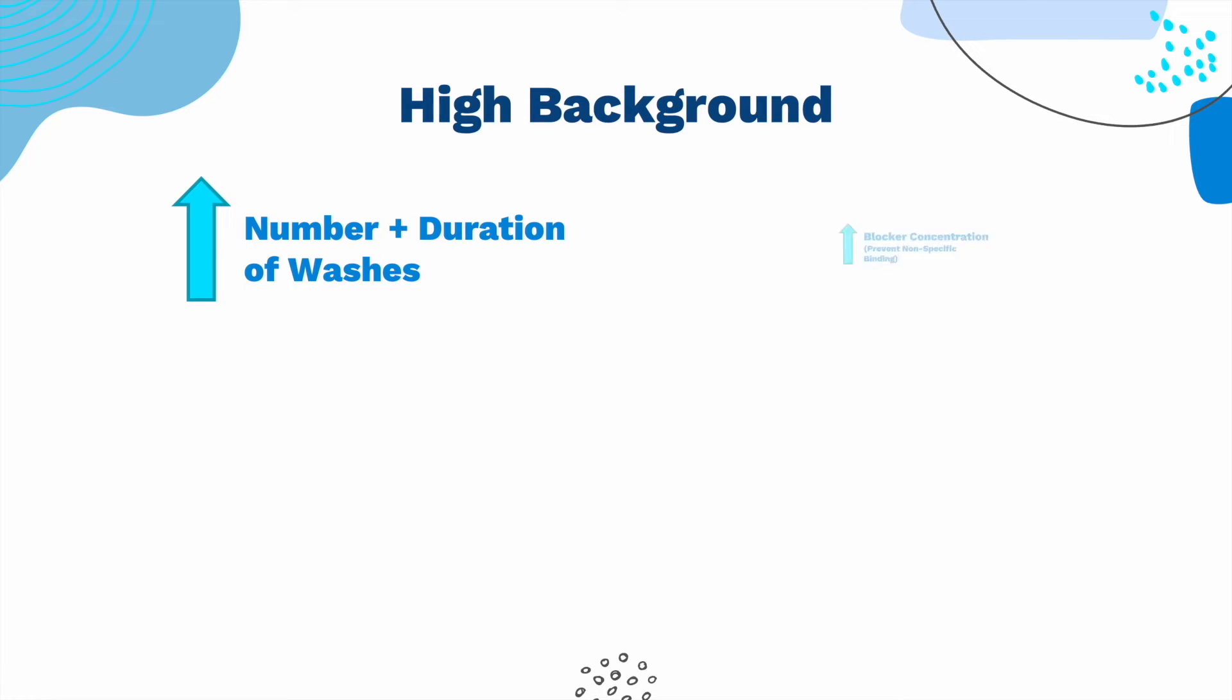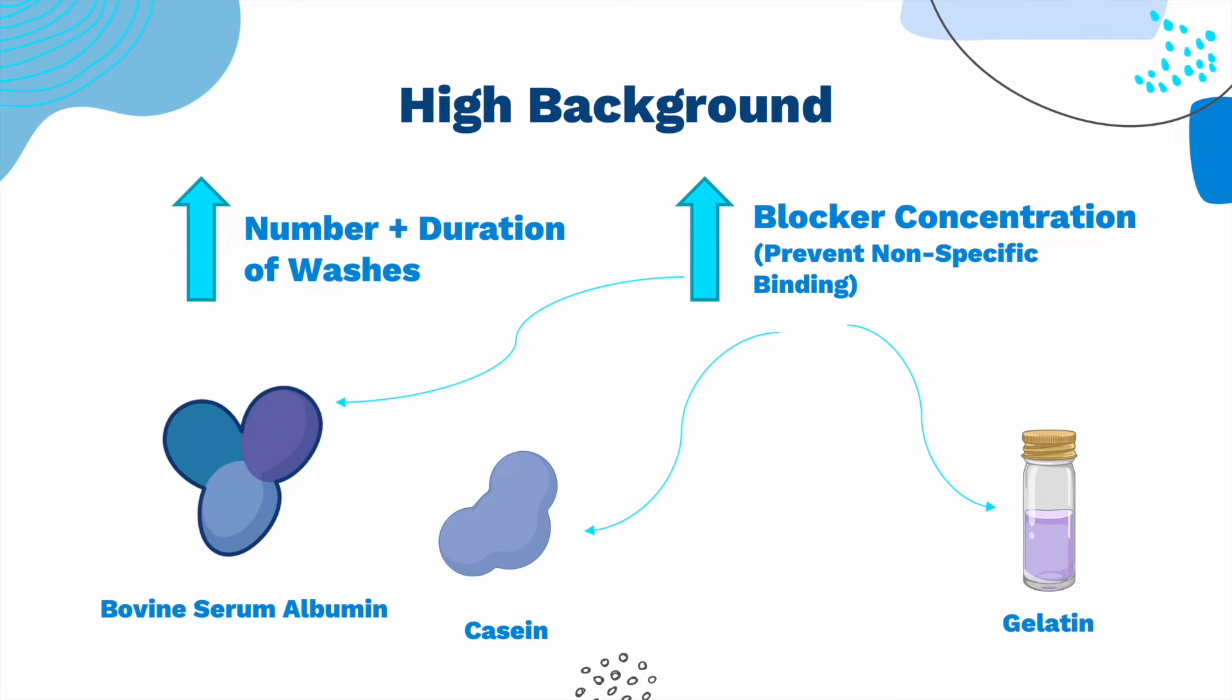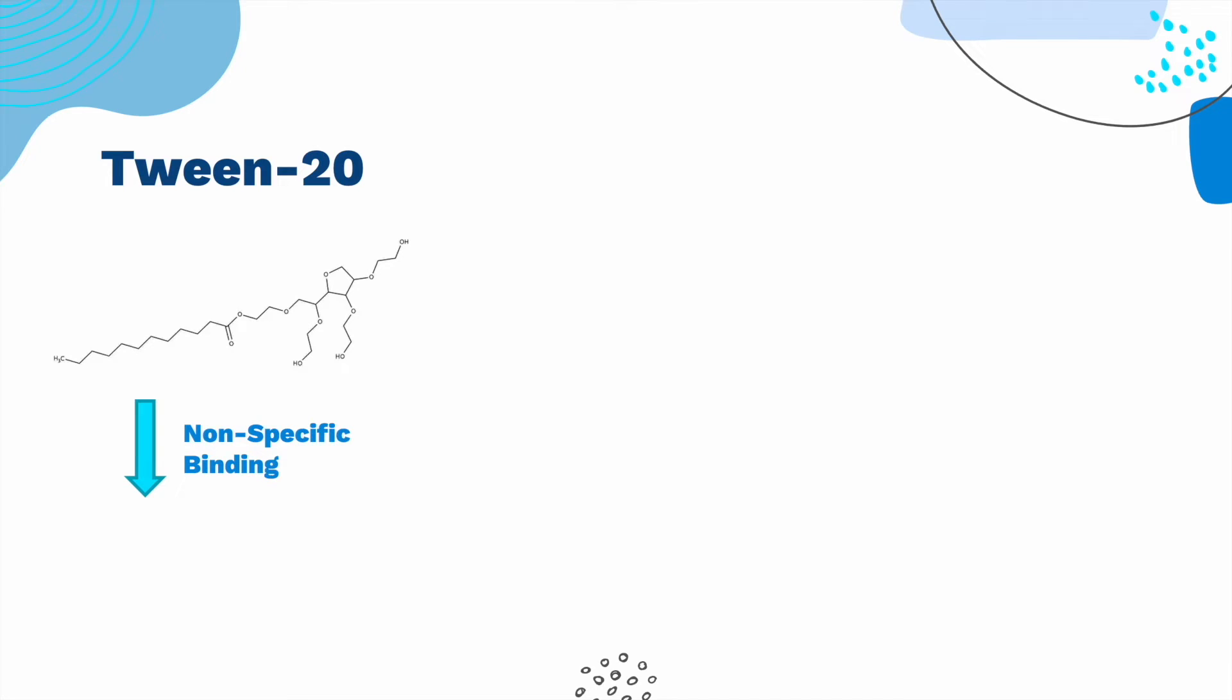You can also increase the blocking time and the concentration of the blocker. Protein blockers like BSA, casein, and gelatin bind to unoccupied sites on the ELISA plate and thereby prevent nonspecific binding. To reduce nonspecific binding, you can also use Tween 20, a non-ionic detergent at a concentration between 0.01 to 0.1%.